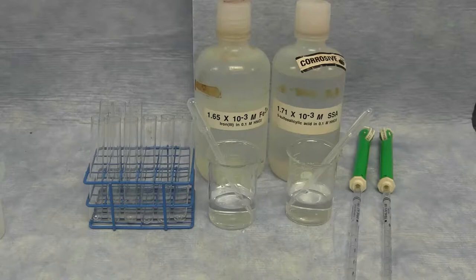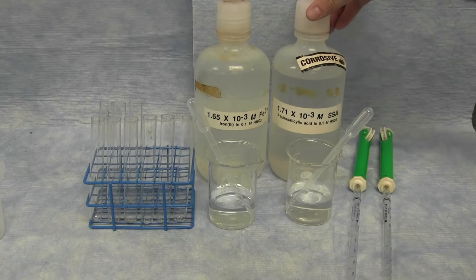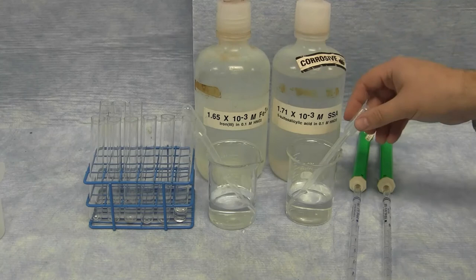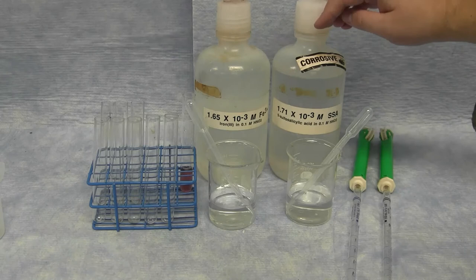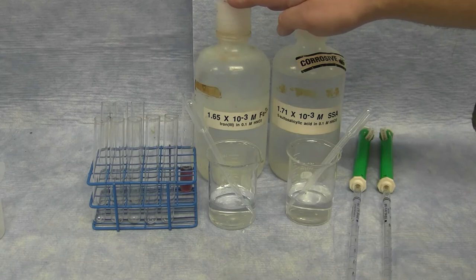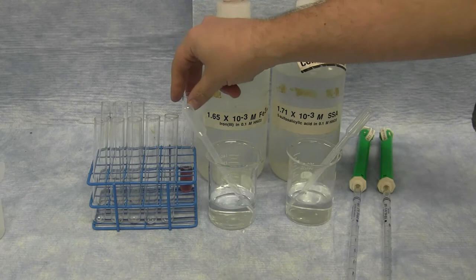In the first part of the experiment, you're going to be reacting solutions of iron 3 nitrate and 5 sulfosalicylic acid, which is abbreviated SSA. The combination of these compounds produces a very intensely colored complex. The purple color of the product is a combination of iron 3 ions and SSA molecules. In the experiment, you'll be determining the ratio of iron to SSA. To do this, you'll be preparing 9 different solutions and measuring the intensity of the resulting purple color.